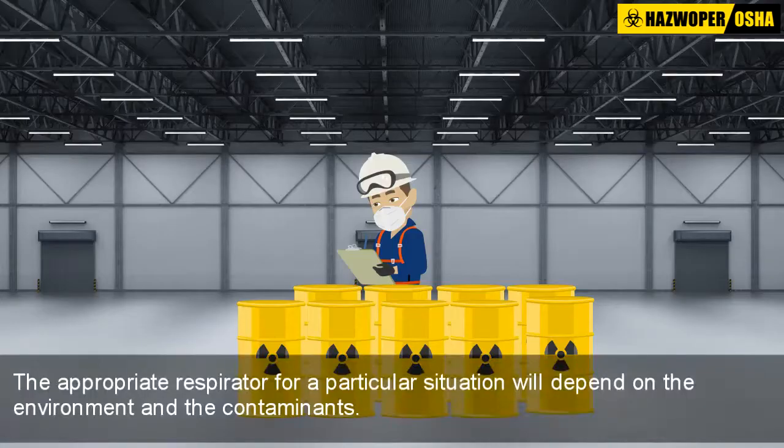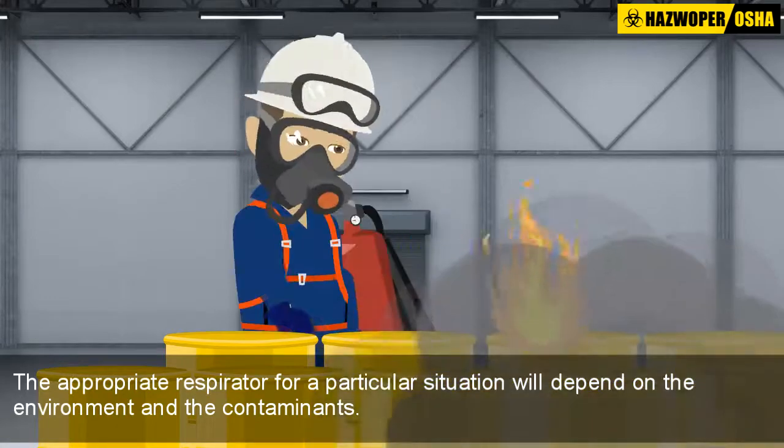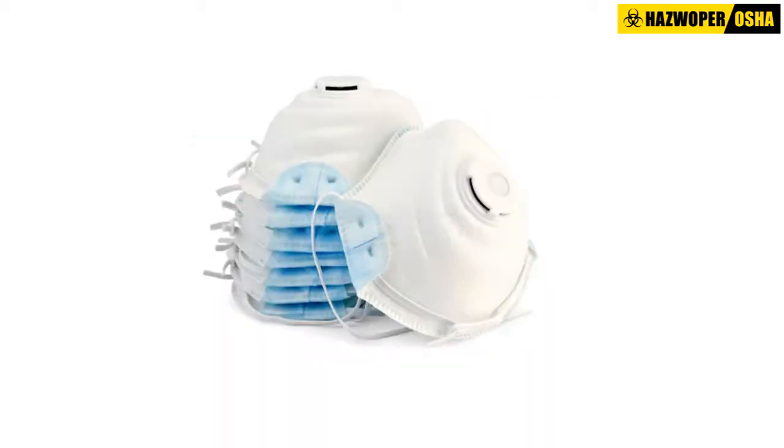The appropriate respirator for a particular situation will depend on the environment and the contaminants. Let us examine the different types of air purifying respirators and the type of protection they provide to the user.